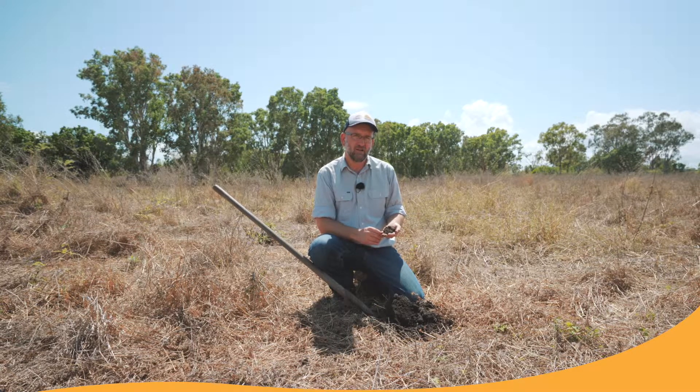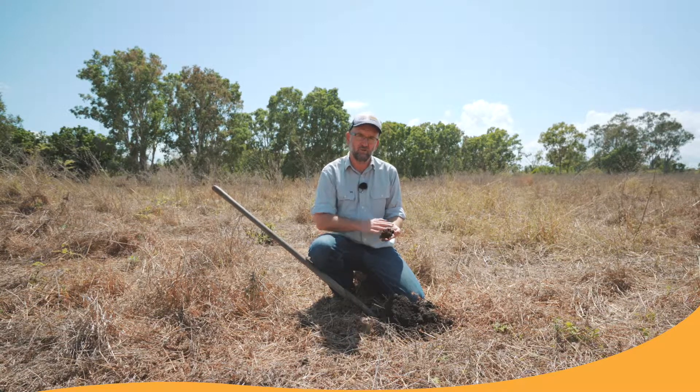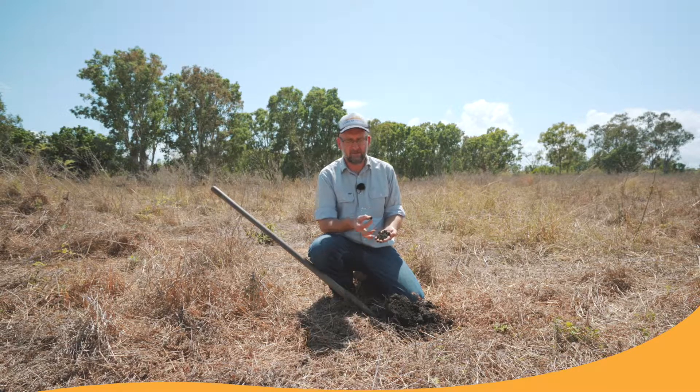When we're talking about soil structure, we're talking about how well aggregated a soil is. A soil with good structure has a good range of what we call aggregates or crumbs. In this little video, we're going to show you how to assess the strength of these aggregates — the building blocks of a good soil structure.